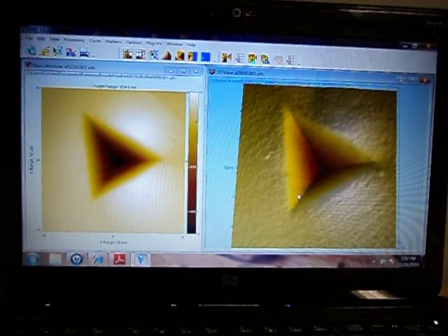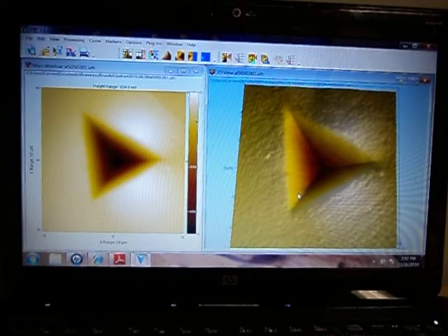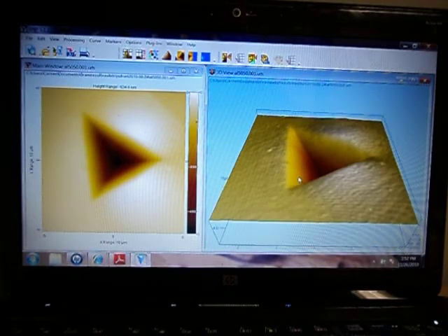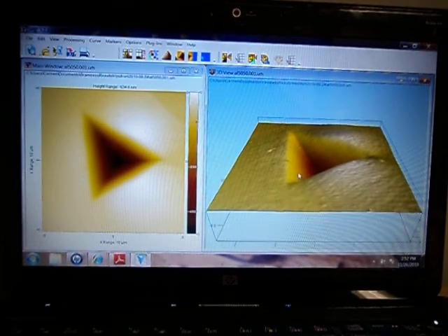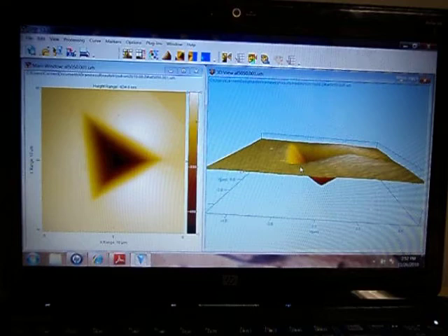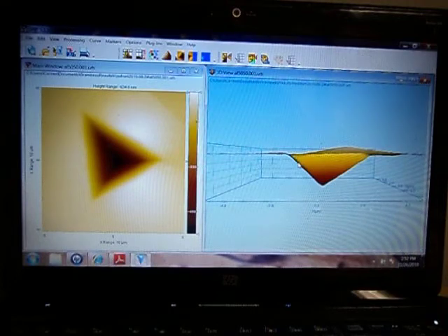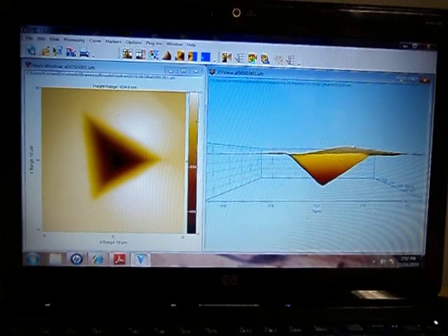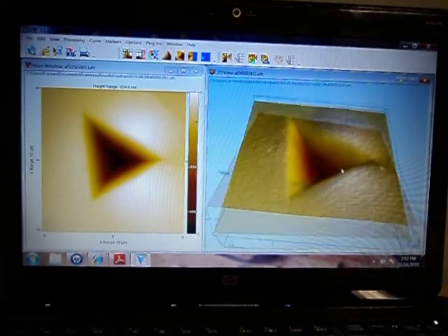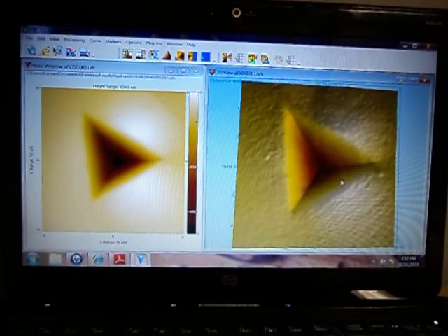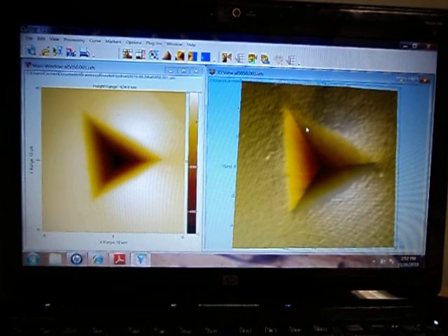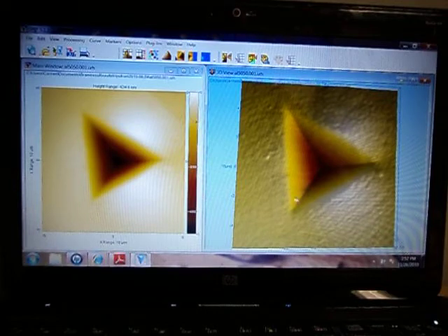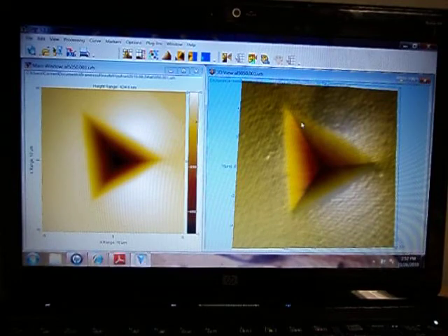It was made using a Hysitron nano-indenter using 10 mN force. You can see in the 3D mode, as you look at the profile, there is some pileup. The indentation was made using a three-sided Berkovich indenter.